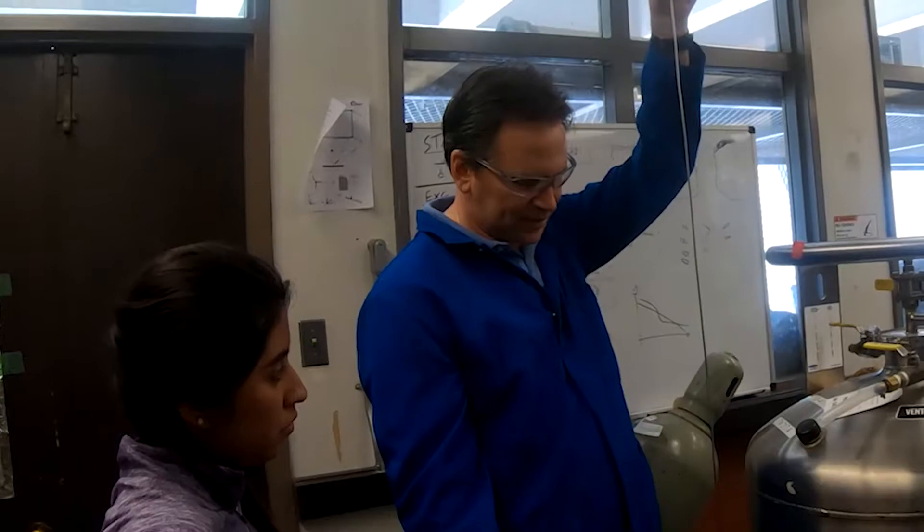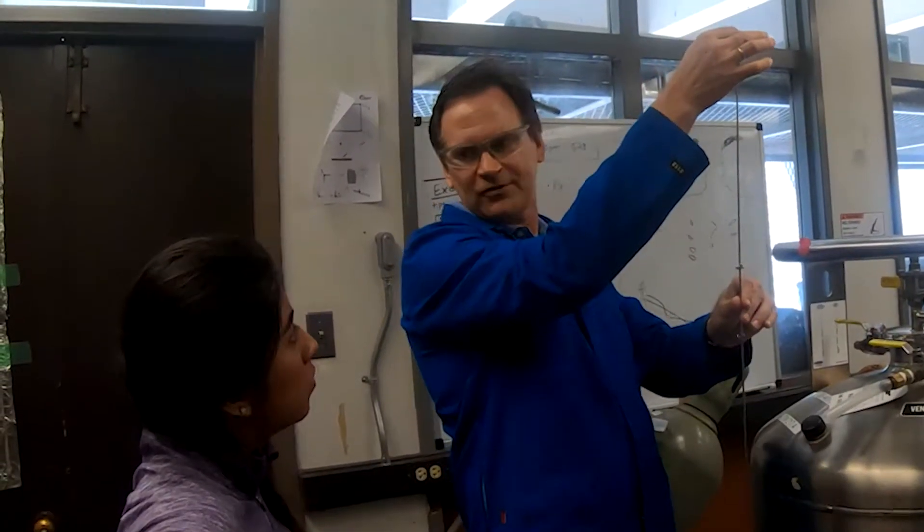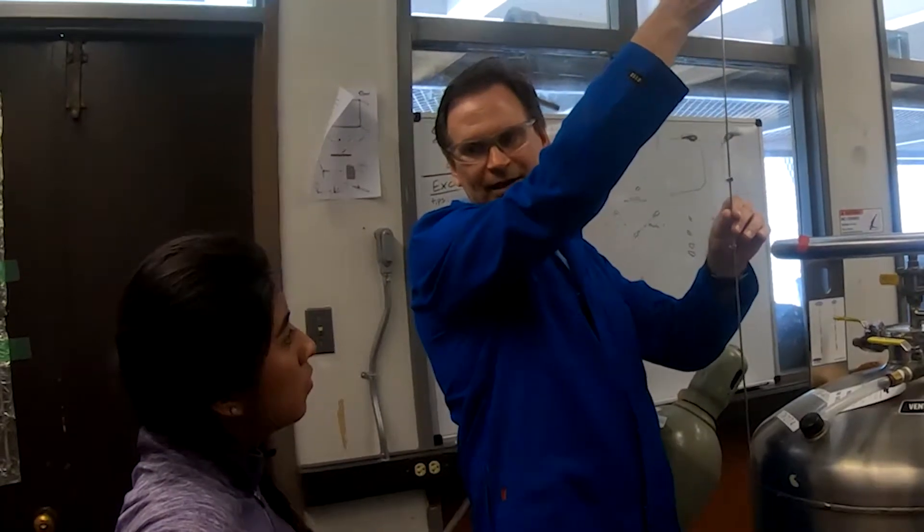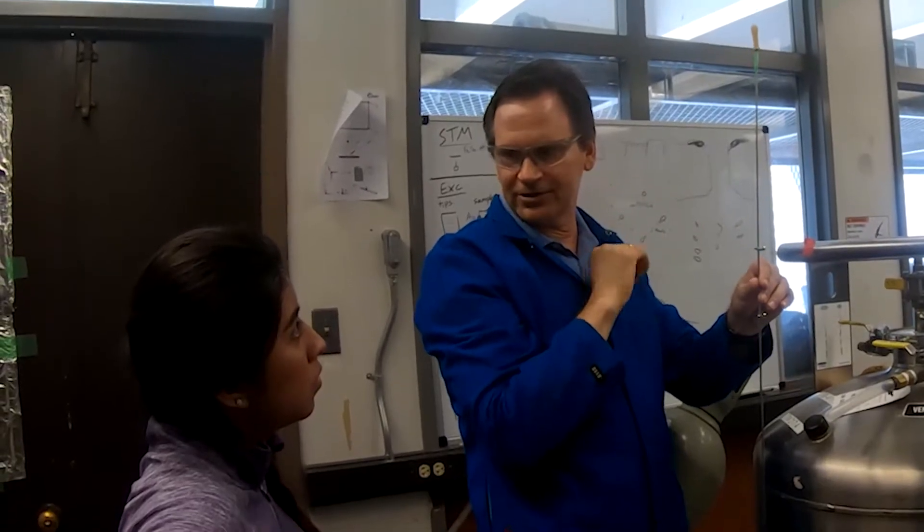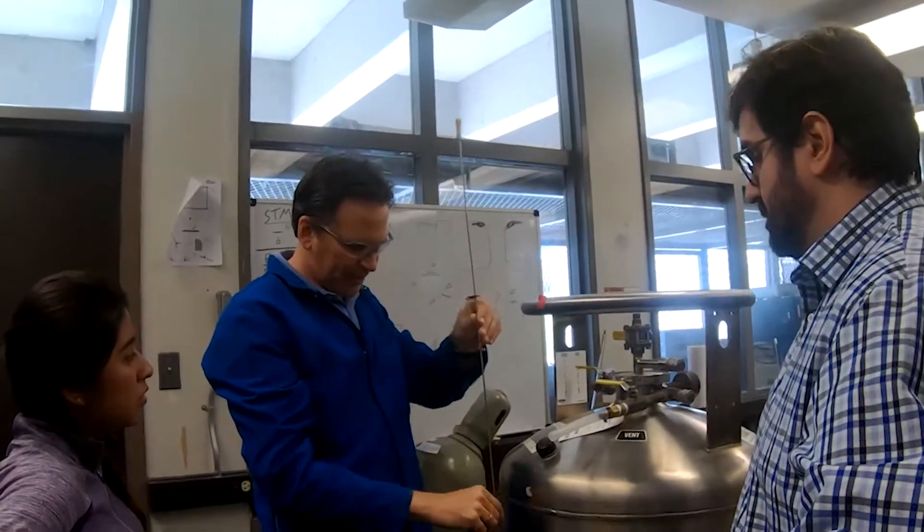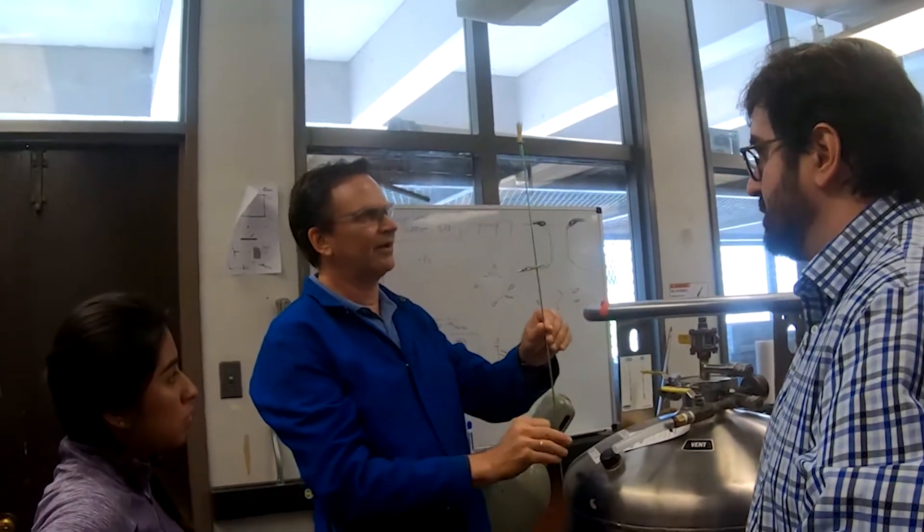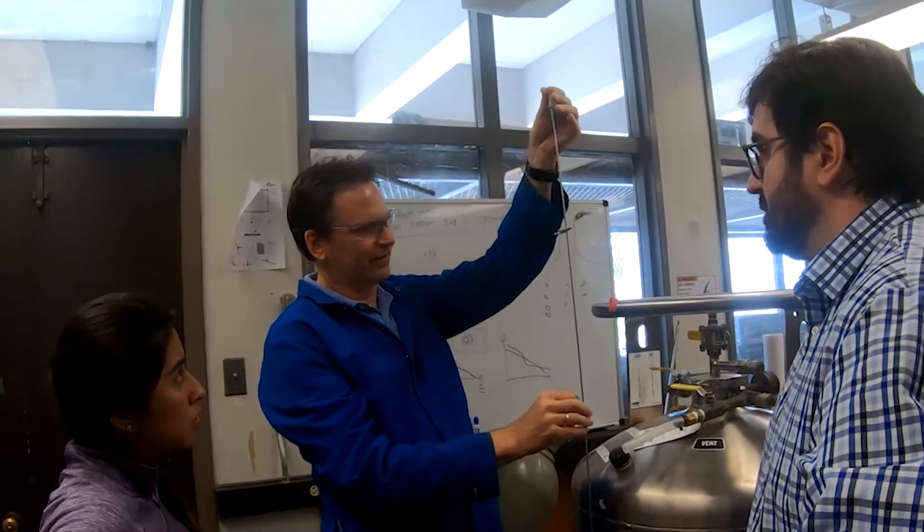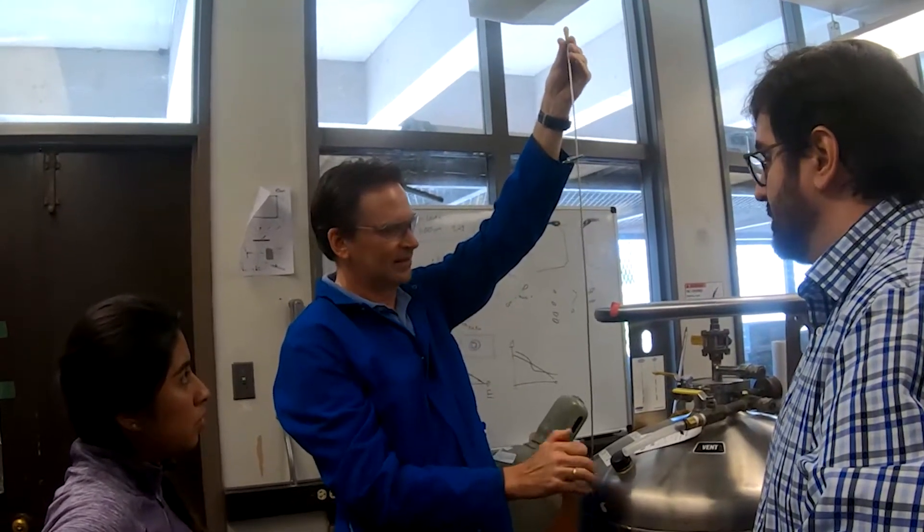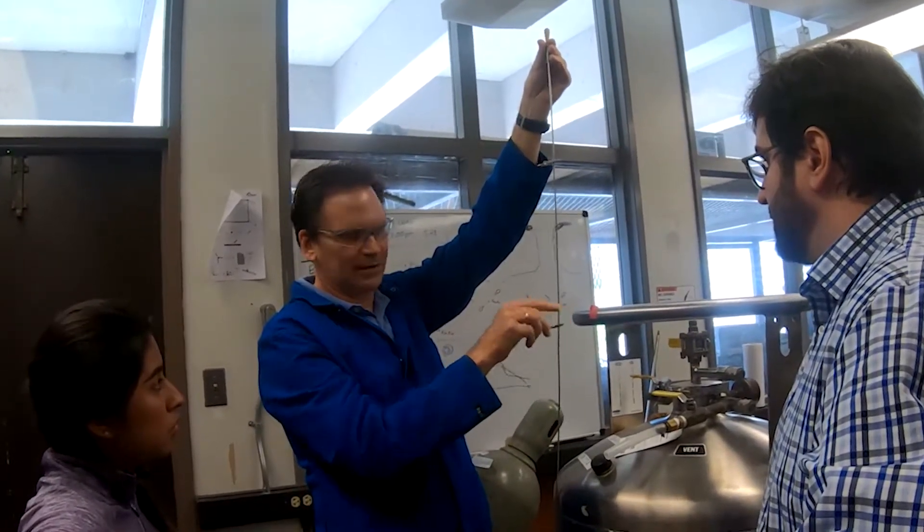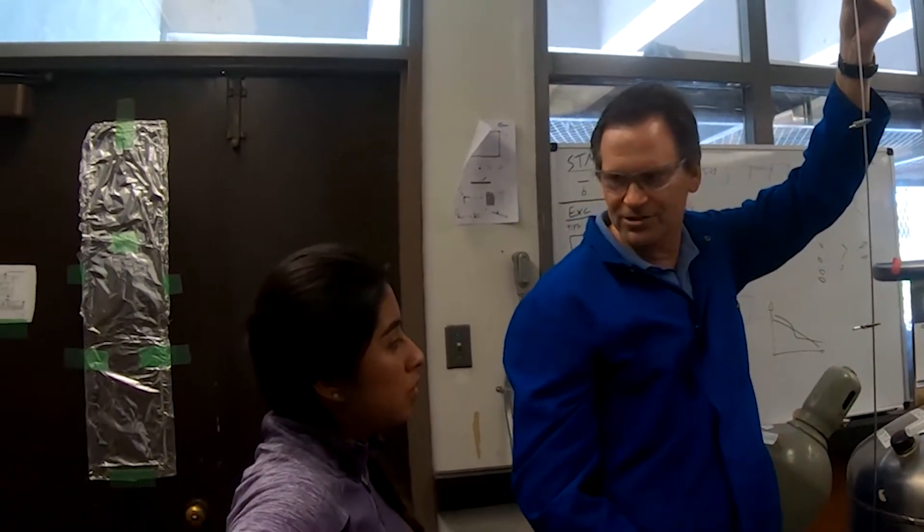And when you approach the liquid level, you'll get a change in frequency. This will oscillate at one frequency when you're above the liquid level and a rapid frequency when you hit the liquid level. The oscillations will slow and change frequency. Lower this all the way to the bottom, mark the level or the bottom of the tube. Then you can start pulling it out. You can actually feel the change in frequency or the change in the rate of the oscillations. Then you can mark it at the second point, measure this and look at the calibration chart.